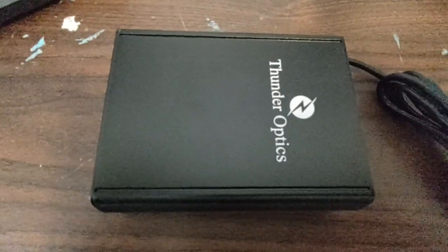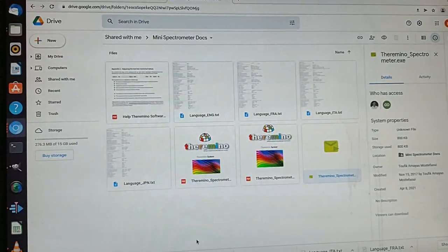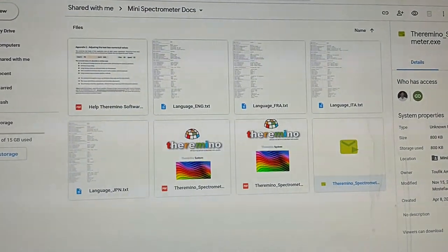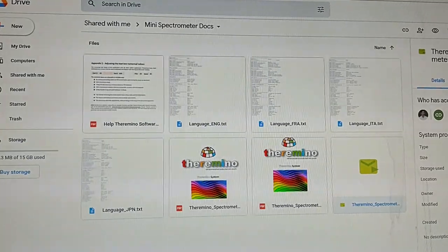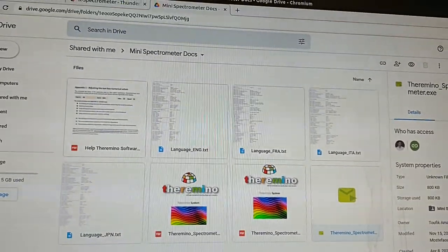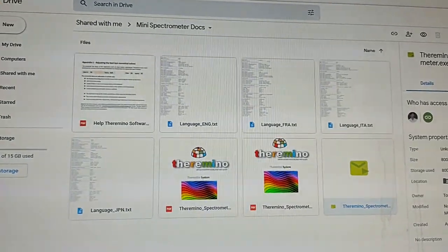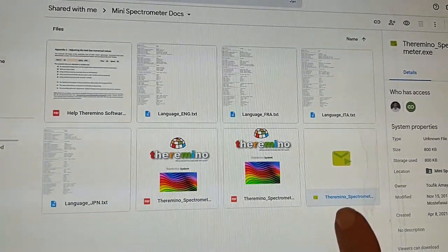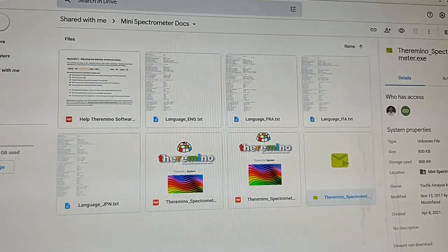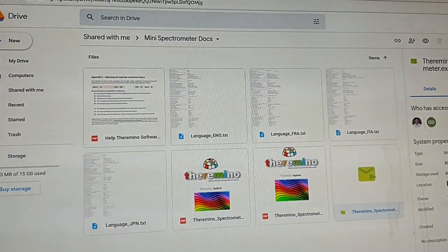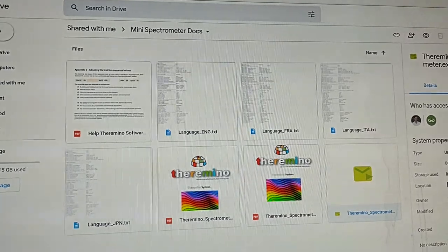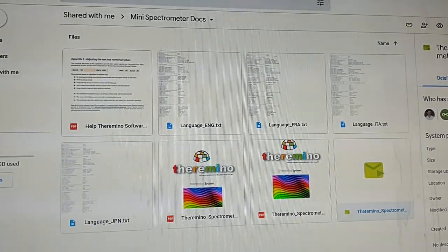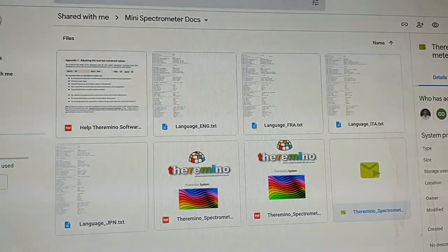Very cool though. I'll probably have to run it on a Windows machine. I usually run Linux because I hate Windows and Bill Gates for many reasons. But unfortunately, people sometimes only write their software for Windows machines. I'll have to check their website and see what the options are. Okay, so I guess they sent me an email. The email gave me a link to Google Documents, and it has some documents that tell you how to run the spectrometer. Looks like this one's an exe file for possibly a Windows machine. So I'll see if I can download these and install it on a Windows machine and see if we can get this thing to work.